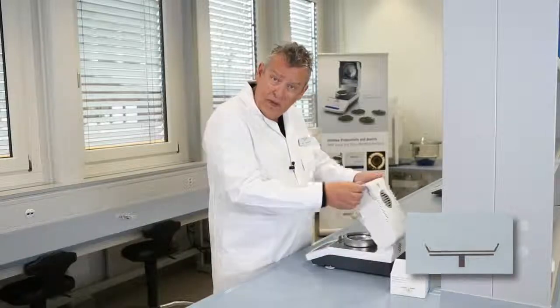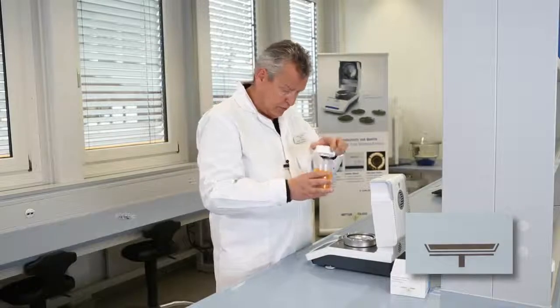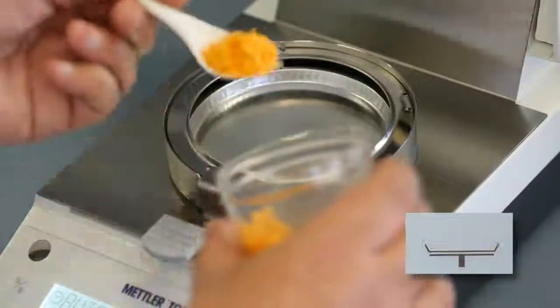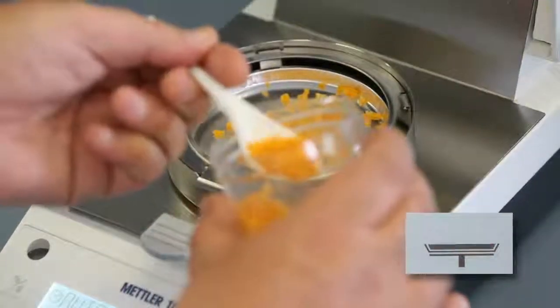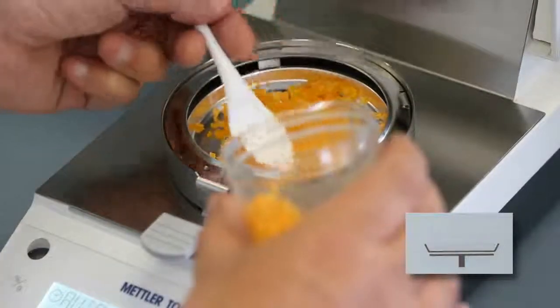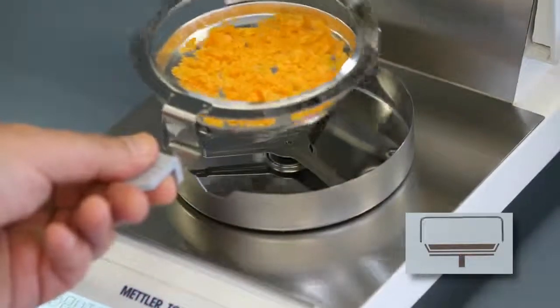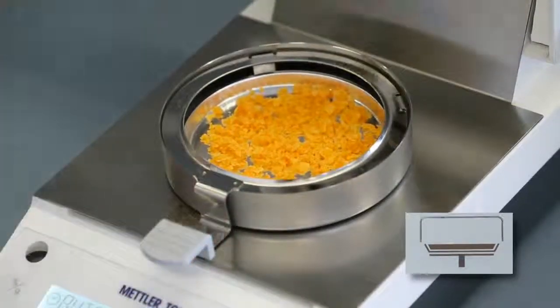We now open the lid, take our sample, and we need to weigh in and distribute the sample on the aluminium sample pan. Typically you would weigh in three to five grams of sample, but the amount weighed in really does depend on the type of sample you're measuring. You have to make sure that the sample is evenly spread around the aluminium sample pan.